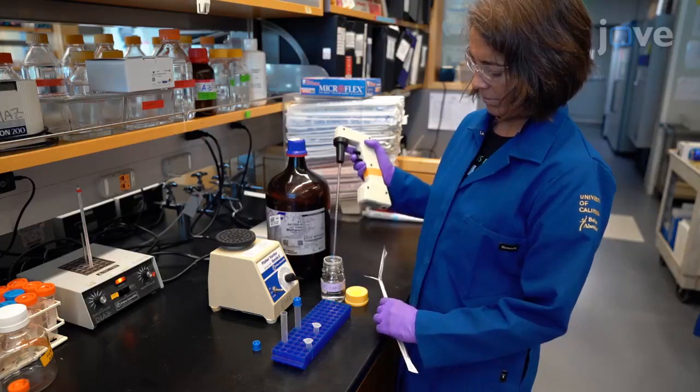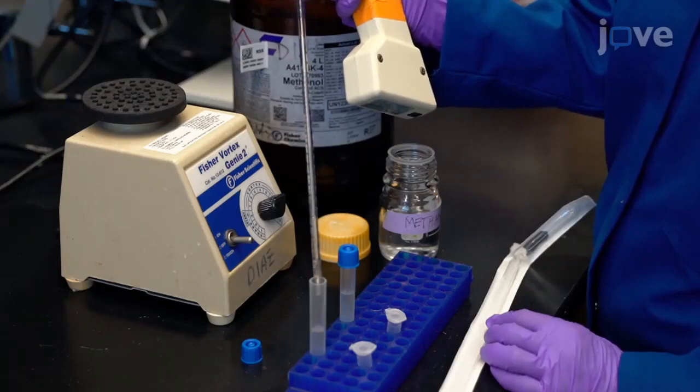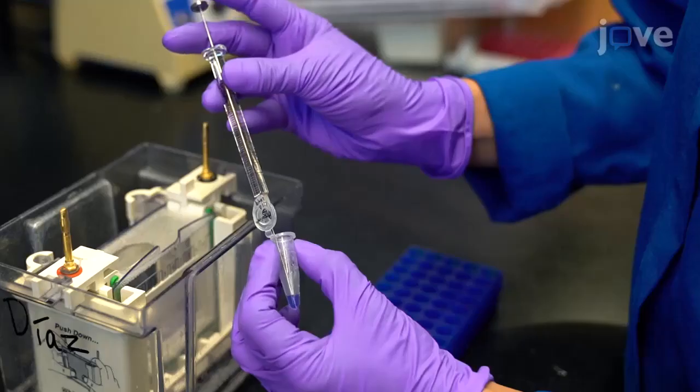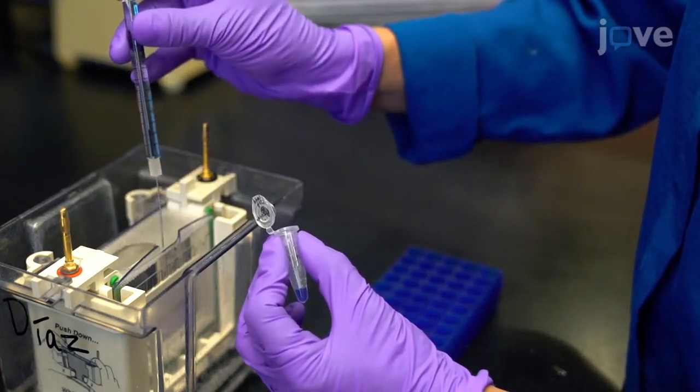This biochemical method allows for the determination of the palmitoylation state of any membrane protein expressed in the brain for which a suitable antibody is available. The main advantage of this technique is that it does not require affinity purification and instead utilizes changes in gel mobility to determine the number of modifications of a protein of interest.